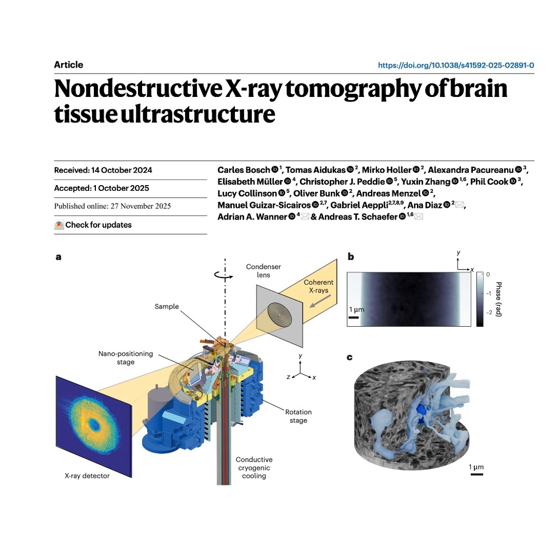So you're destroying the sample as you image it, and then you have to try and computationally restack all those slices perfectly. Yes, and that introduces so much risk, alignment problems, errors, and it is notoriously slow. We're talking about month-long experiments? Easily, for just one small volume. It works, but it really limits the size of what you can analyze.